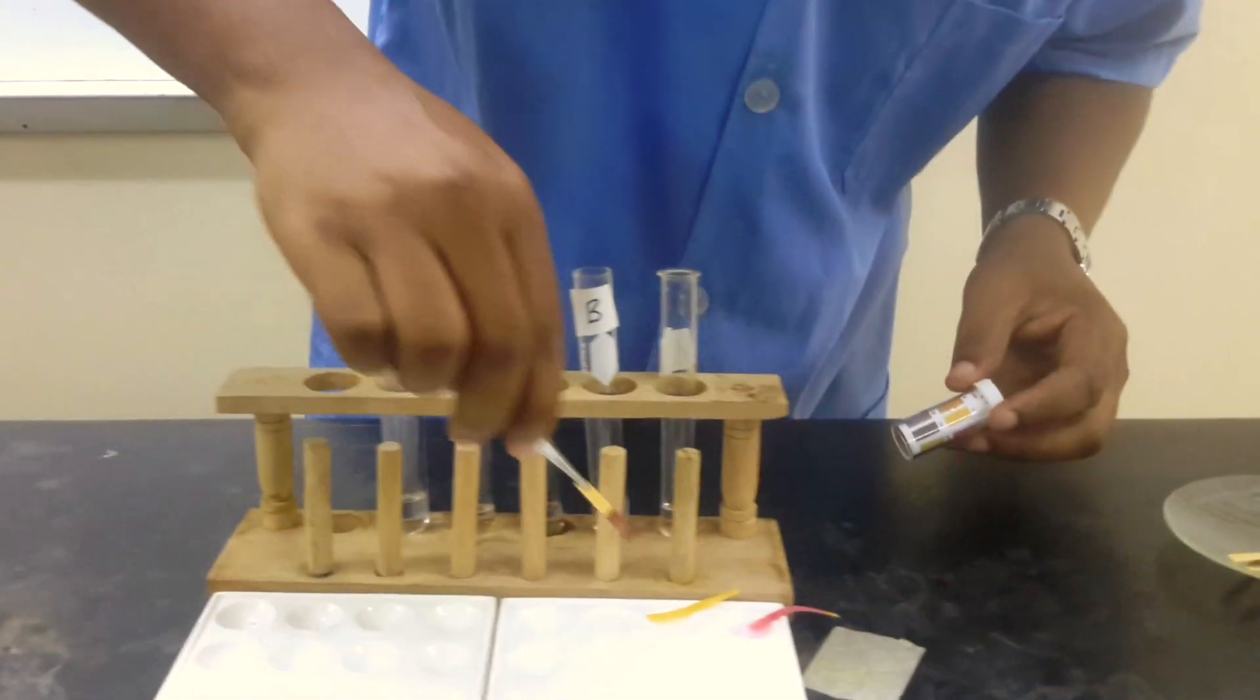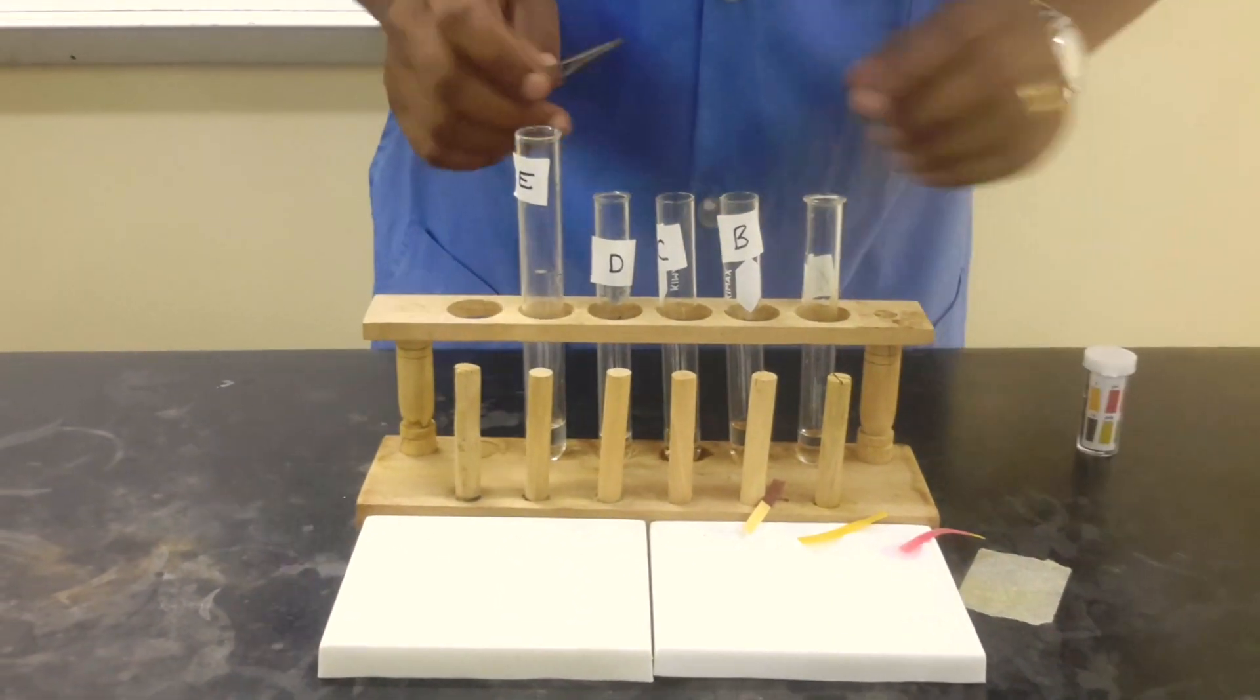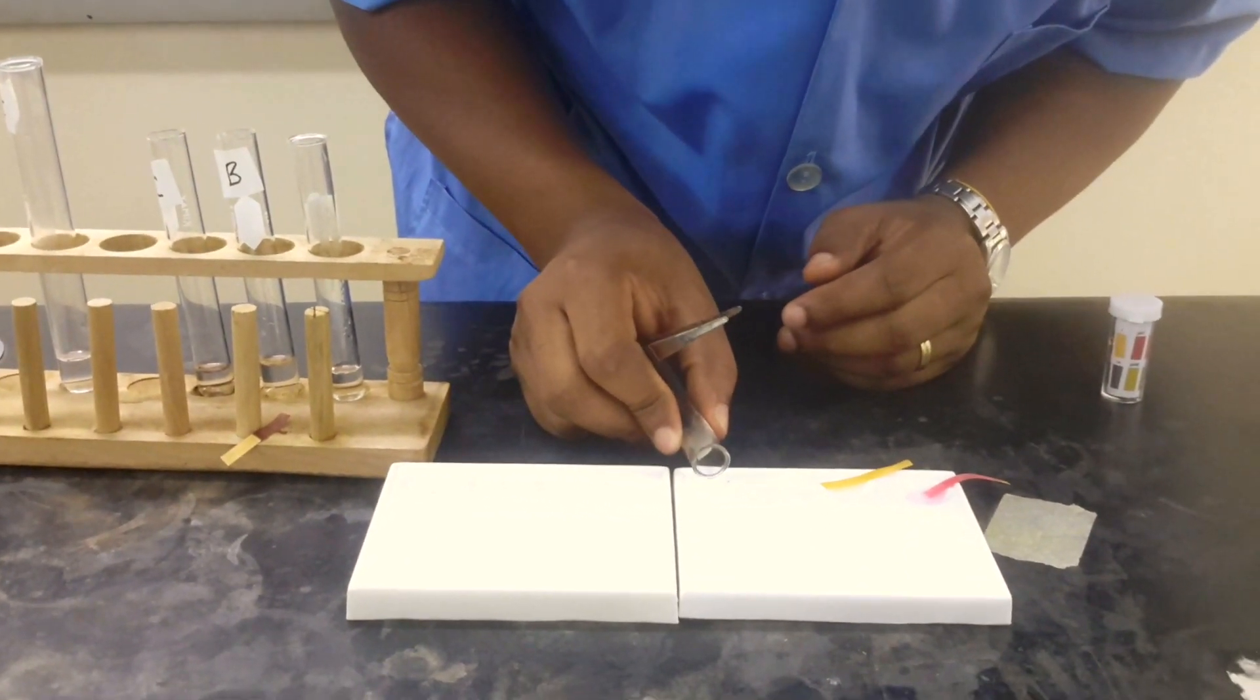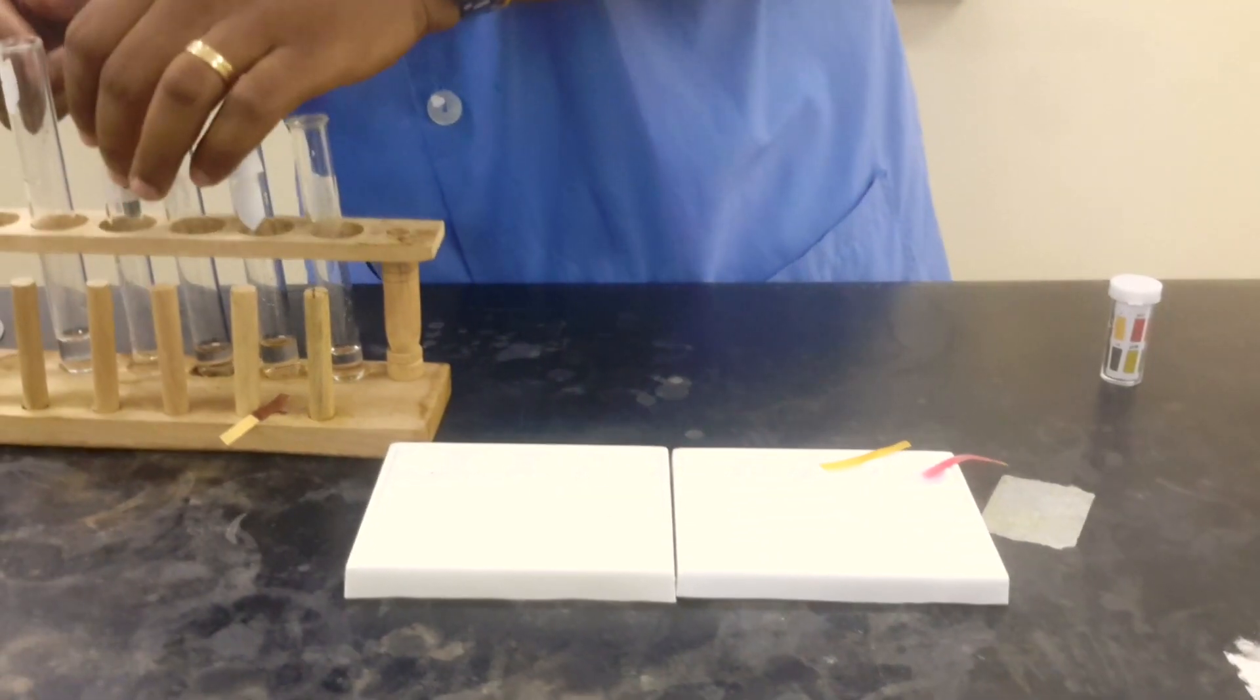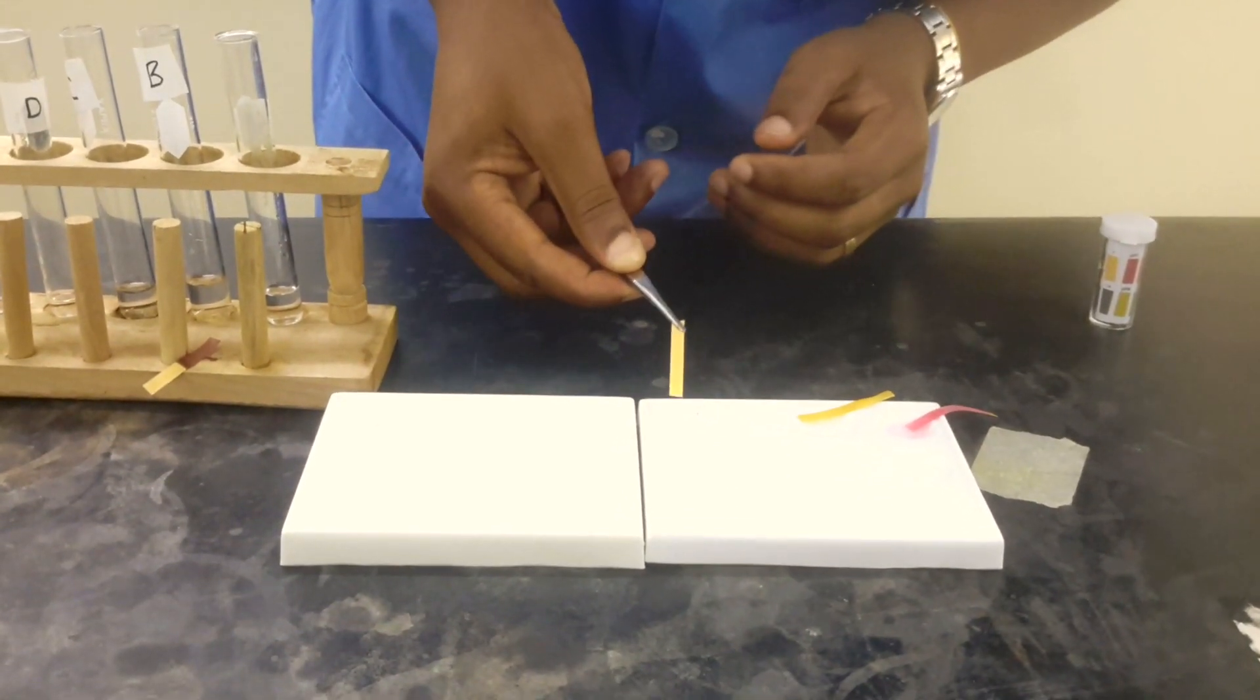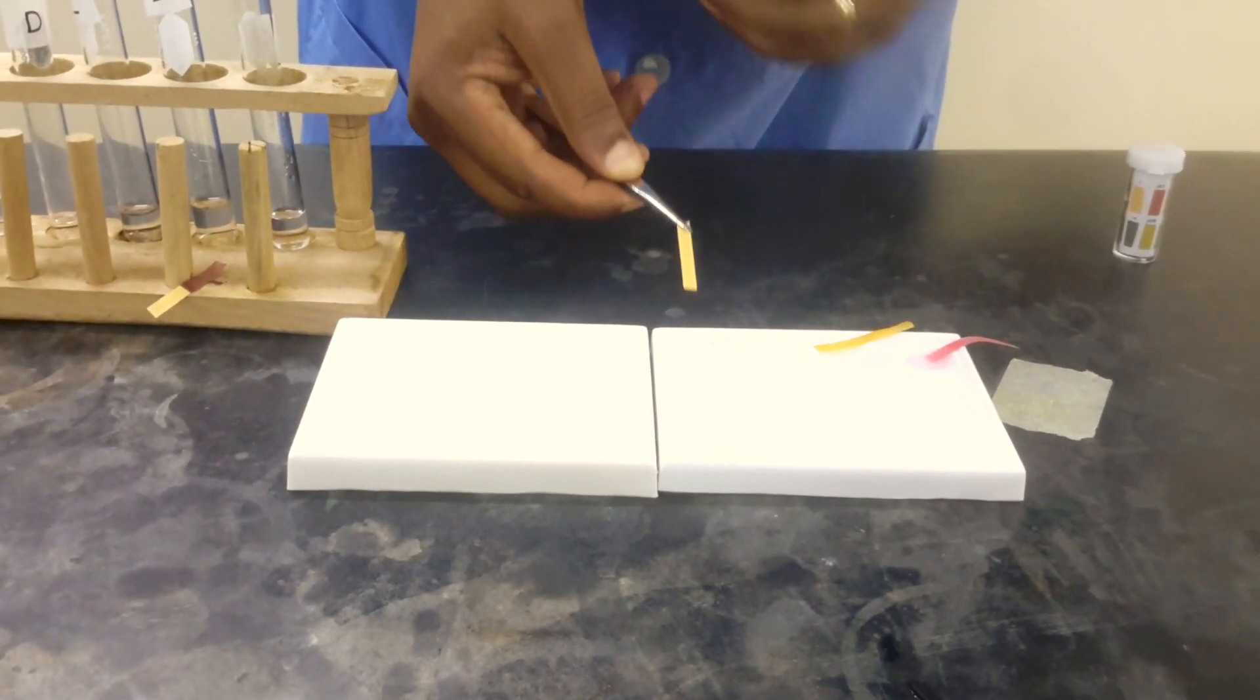We'll keep going. That was C. So this is now D. We'll just pour a little of D, and careful not to touch the strip with my hands because that could contaminate the strip, especially if my hands have chemicals on it.